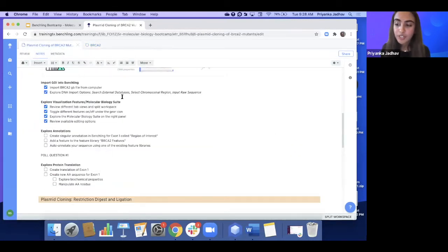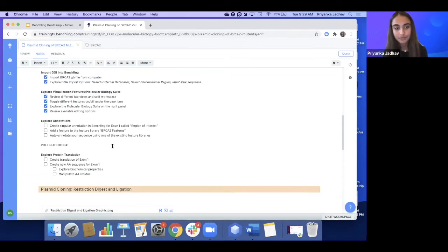So not only does Benchling's feature library creation standardize the terminology that you and your organization might be using, but in addition, our feature libraries do give you the ability to reduce the manual labor that goes in when individual researchers are perhaps going through and annotating manually every sequence individually. So feature libraries have a lot of value to them, and we hope that you and your organization get to use them to standardize your work, as well as enhance efficiency when you annotate your sequences of interest.